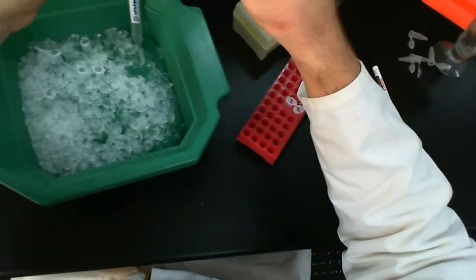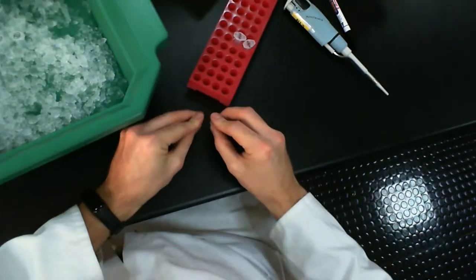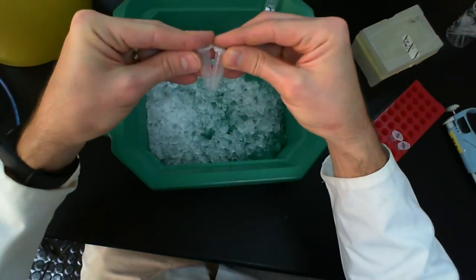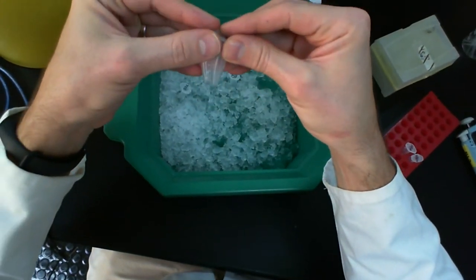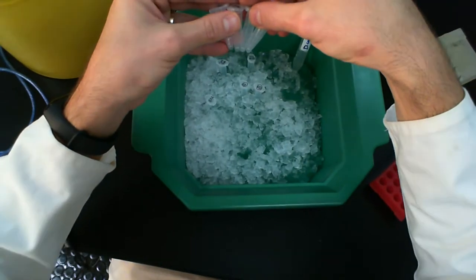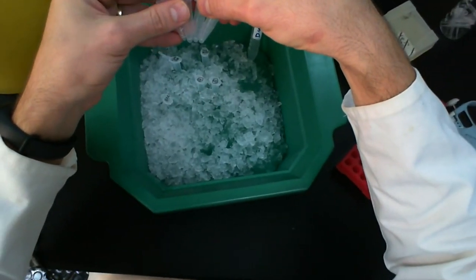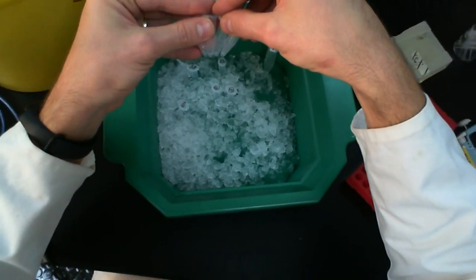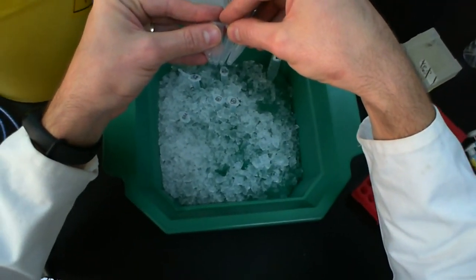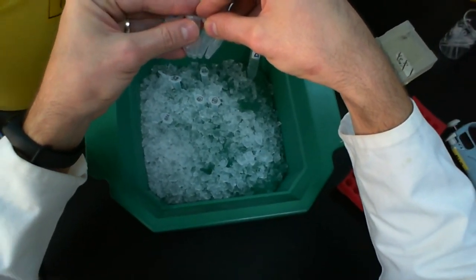Now in my case, I was adding all of these to the bottom fairly carefully, and so most of the liquid is at the bottom of the tube. If you find that your liquid isn't all at the bottom, then you can take these into the microfuge and spin them down briefly for 30 seconds at whatever speed really will do it, so that all the liquid is at the bottom.